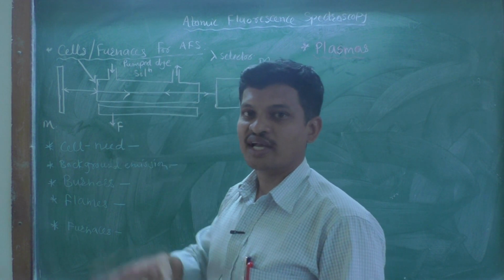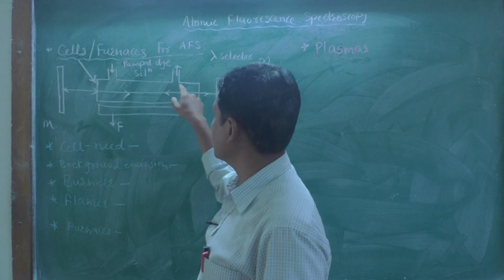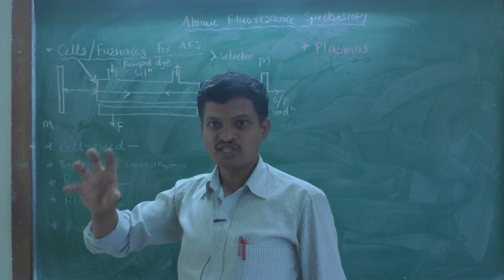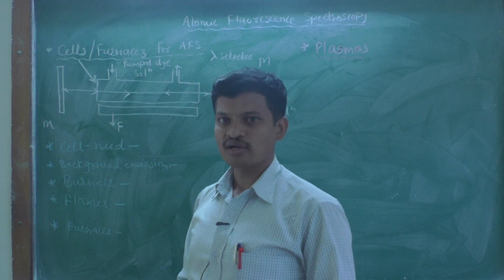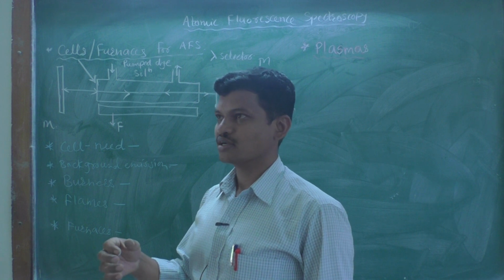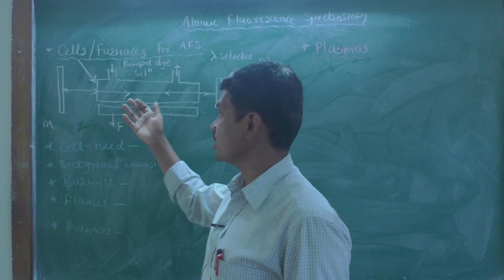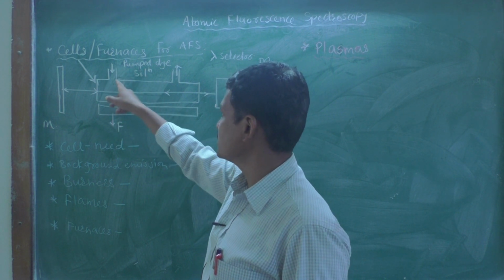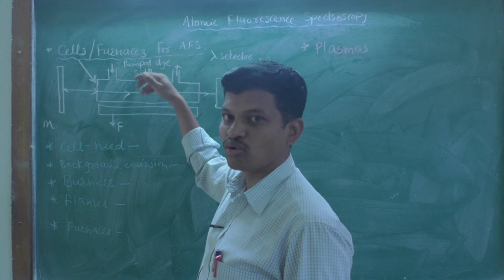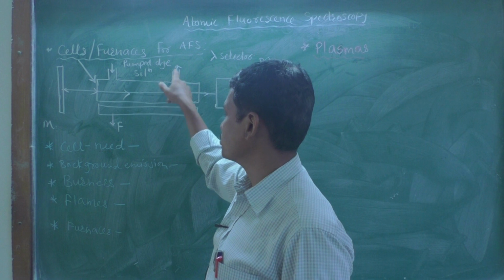The dye solution is pumped in from the inlet and goes out of the cell from this outlet. The dye solution is responsible for the fluorescence to occur; it is the medium.